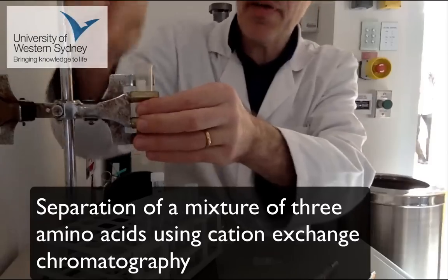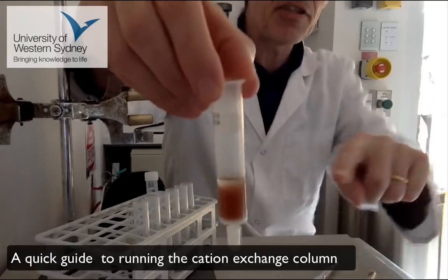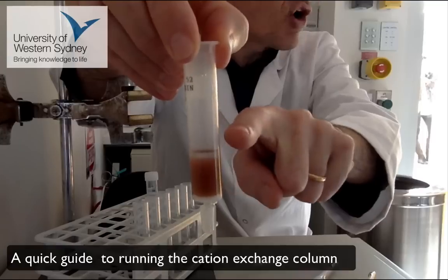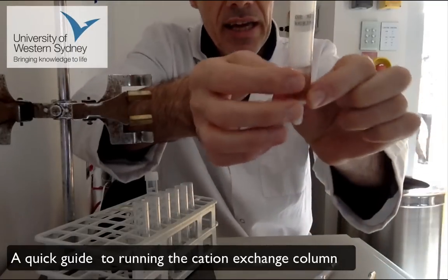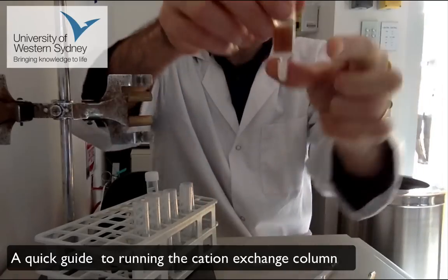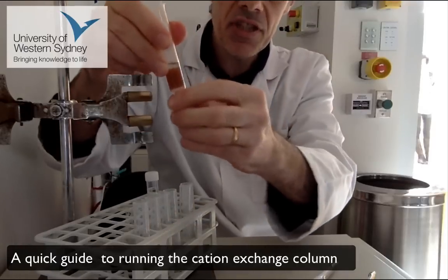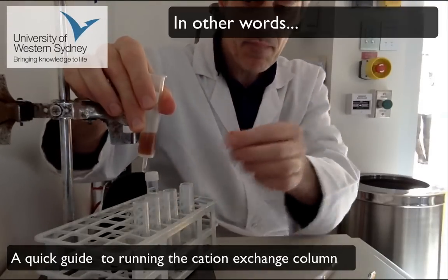So here is the column that you'll be working with. It's more of a syringe with a sample in it. So this brown sample here is the cation exchange column, all right? And this column currently has a very little bit of buffer on the top. So it's got a cap here, which you can remove. When you remove the cap, it will start to drip. The solution starts to drip through, okay?